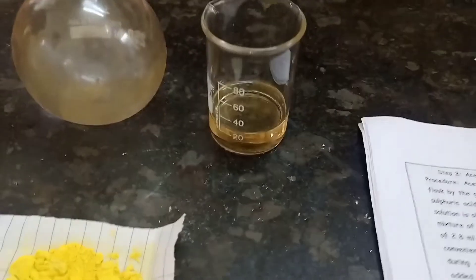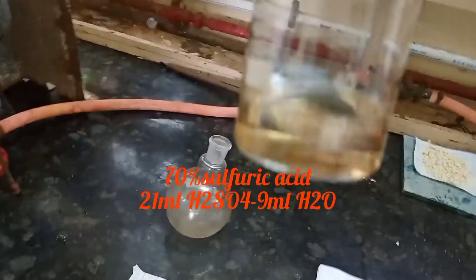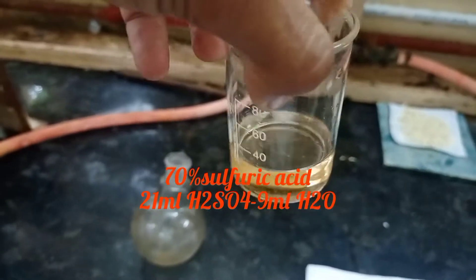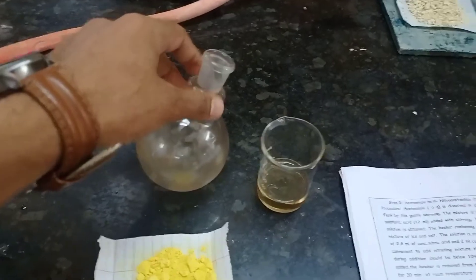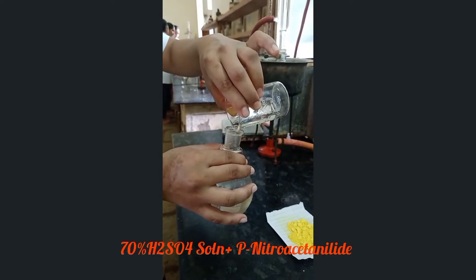Prepare a 70% sulfuric acid solution using 21 ml of H₂SO₄ and 9 ml of water. Take a round bottom flask and add this 70% H₂SO₄ solution into it.